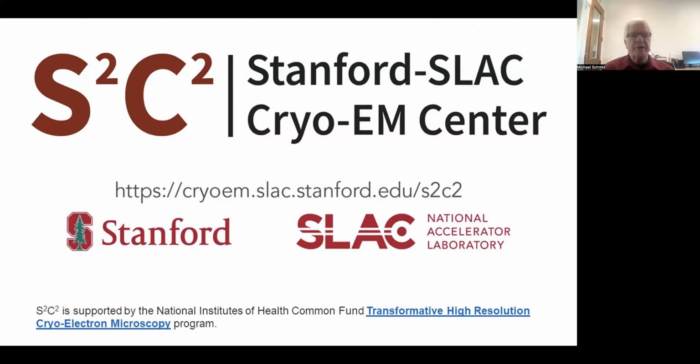There will be one in February where users can test drive our new Chameleon and Vitrojets, and of course the Vitrobots that we already have. And we expect to have users on site and lectures for people who want to learn about them remotely, including screening right after the freezing. So that's going to be very interesting.